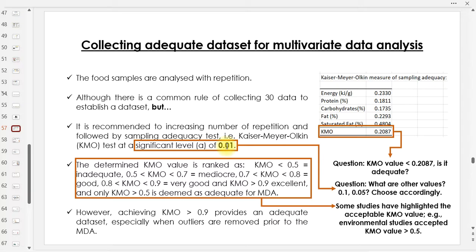So that's why I recommend go higher. If you want to go higher, you can make 0.0001. Yeah, it's 99.999%. So if you have a database, it's very accurate. Okay, so this is why we choose 0.1, 0.05, 0.01. Yeah, this is the meaning lah.